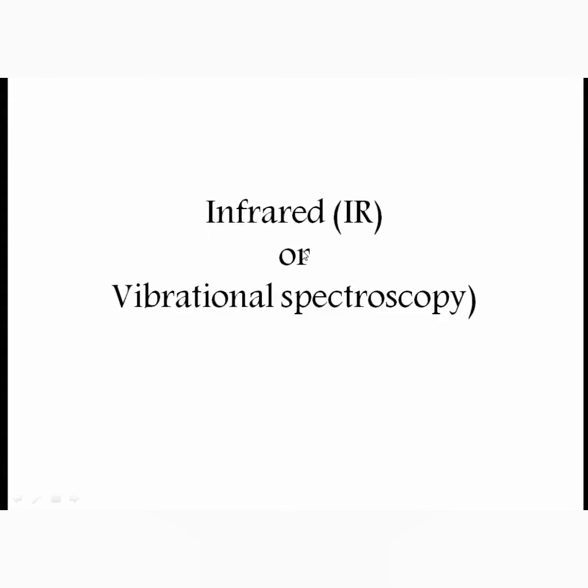Today we are going to take infrared spectroscopy, otherwise known as vibrational spectroscopy. Why is it known as vibrational spectroscopy? If a molecule interacts with electromagnetic radiation in the range of 400 to 4000 centimeter raised to minus 1, that is wave number, then there is a change in its vibrational energy levels.